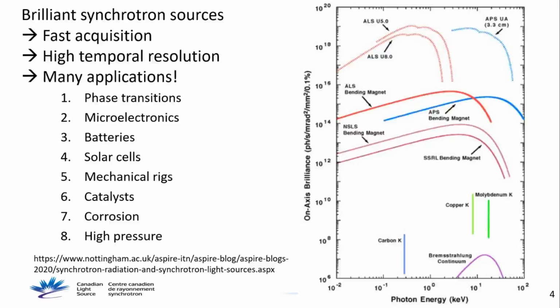We'll see phase transitions, which XRD is ideal for. This has application in microelectronics, batteries, solar cells, mechanical applications, catalysis, corrosion, high pressure, and you name it. I'll have a few examples within my time frame.